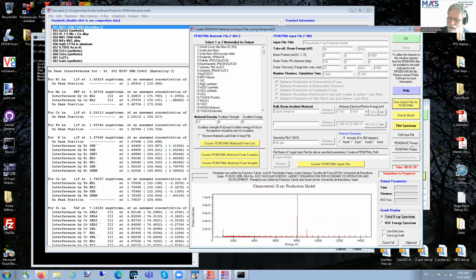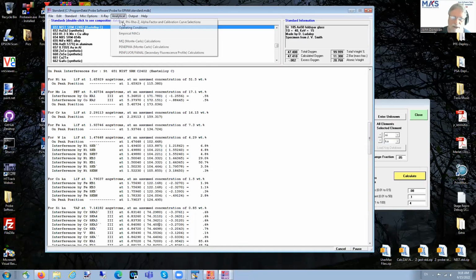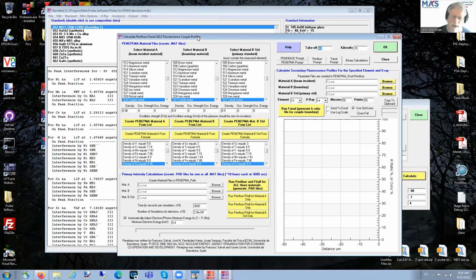So I'm going to just cancel that for now. The cancel button is always here in the main window, and close this. And then I'm going to pull up something which I think is probably the most interesting thing I'll show today, because this is something that is a big problem in microanalysis. And this is where people are analyzing close to the boundary of a grain. And you might not have any electrons incident on the grain boundary.